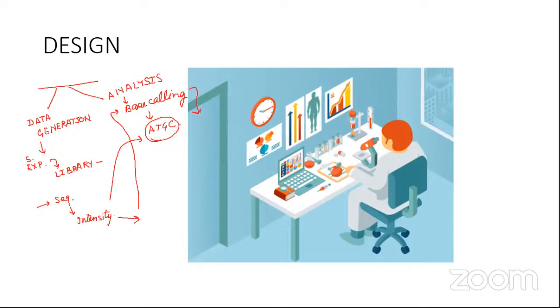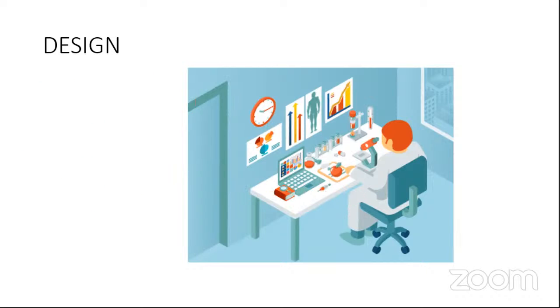This is stored in the form of FASTQ files. From this, we go for different kinds of data analysis. So let us see all these steps one by one.